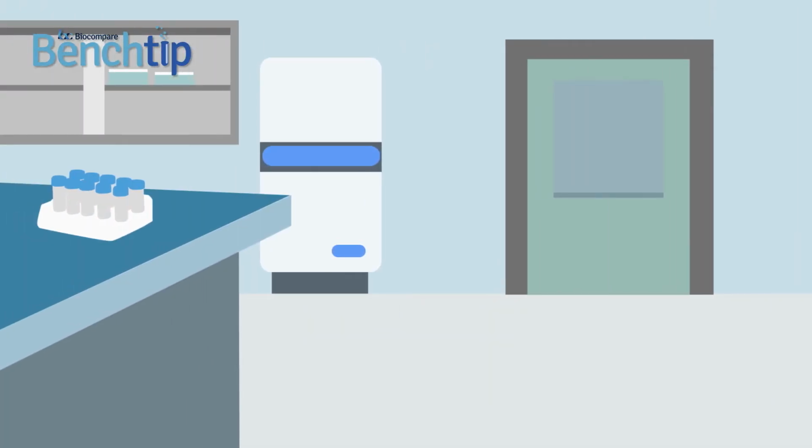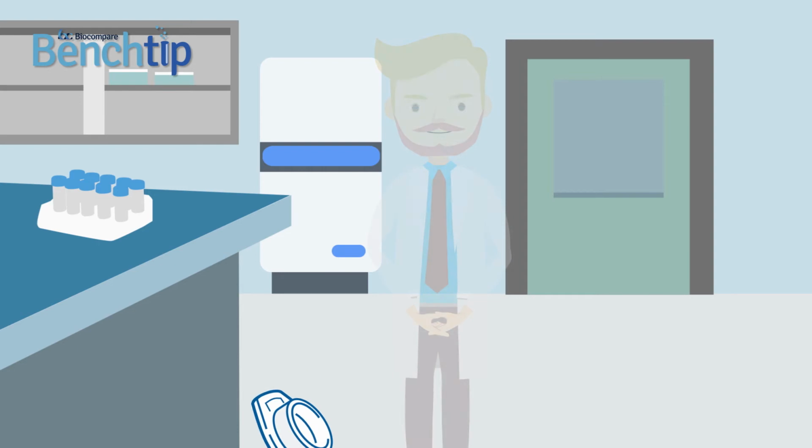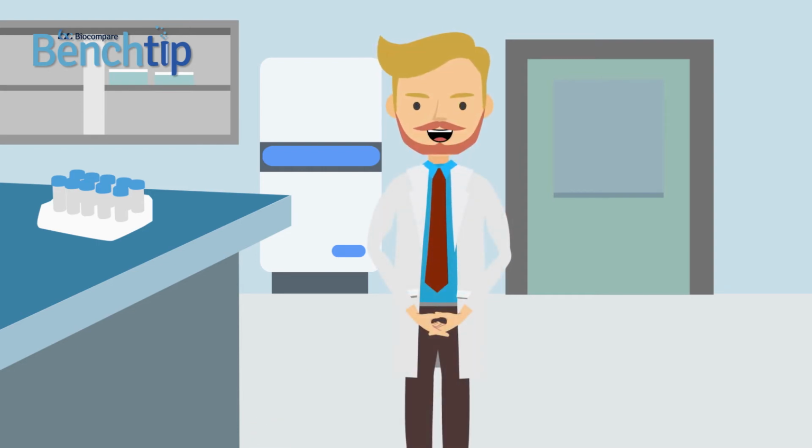Since these materials are not incorporated into the polymeric chains but persist in the final product, they can leach from the surface of tubes, plates, or pipette tips. Certain solvents, high temperatures, and buffers can exacerbate leaching of these agents from plastic labware.